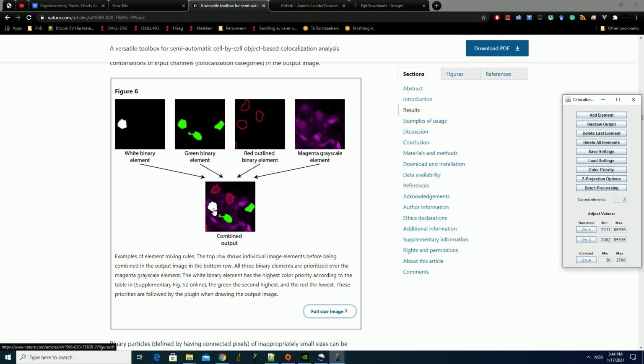For example, this white represents nucleus and another signal, and green represents only the other signal, but then you know that white of course has to contain the other signal because it represents both the nucleus and the other signal, whereas these are not nucleus. So that's how this can still be useful.